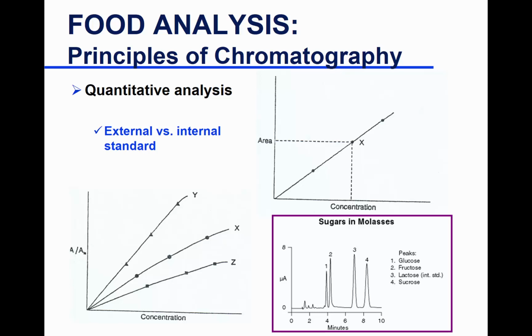Say that you put your internal standards in your sample, and then the sample went into the water bath to evaporate, and then something spilled there. So your concentration has suffered a little bit of loss of your compound of interest. But the internal standard also got the same treatment. So the same proportional loss happened in your sample solute and in your internal standard. So when you correct for that, when you take the ratio, it corrects for any spills, for example.